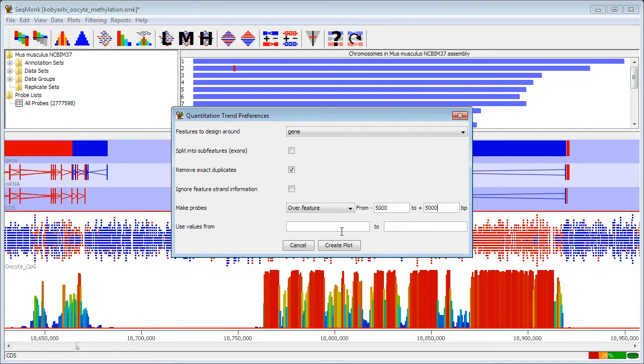Because my quantitation for my methylation won't necessarily have had enough data to calculate a methylation value at each point I can filter the values that I want to use in this plot.